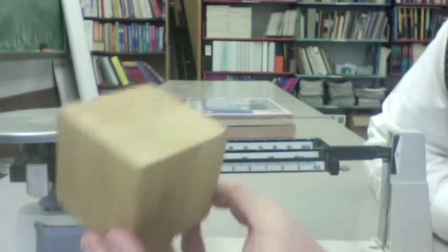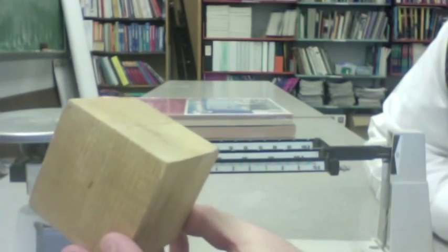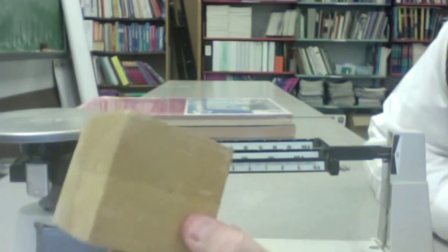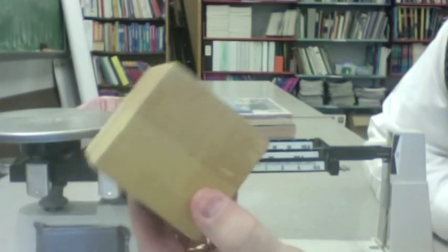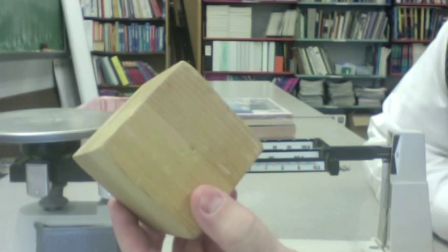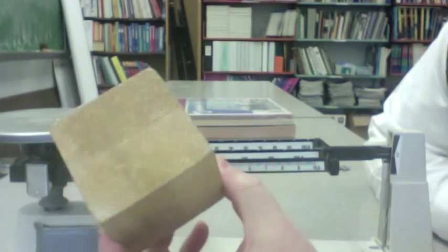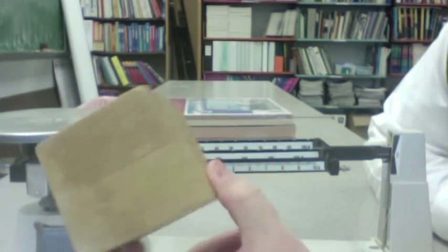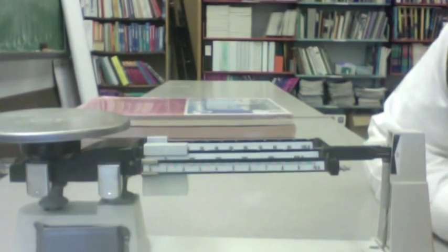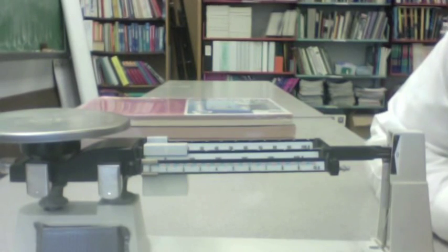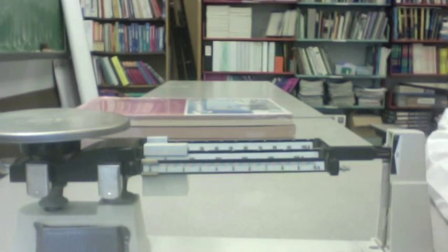My goal is to measure the mass of this block. I want to know how much stuff there is here. And to do so, I'm going to use a tool called a triple beam balance. This is my triple beam balance.